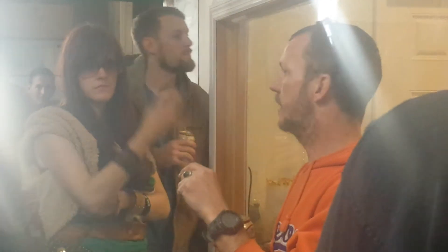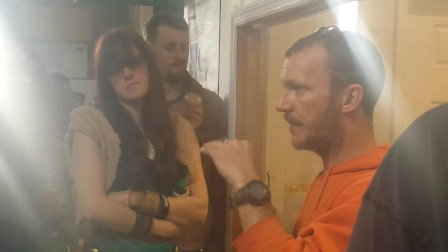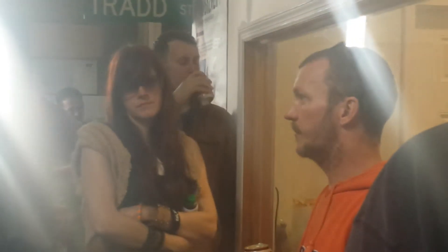In 11 weeks, if I transfer it every week in a factor of 10, each pastry plate can grow about a million pounds of mushrooms in 11 weeks. So I don't need a million pounds a week — I wish I could sell a million pounds a week. So my job is to actually throttle them and slow them down. I only need X amount a week.